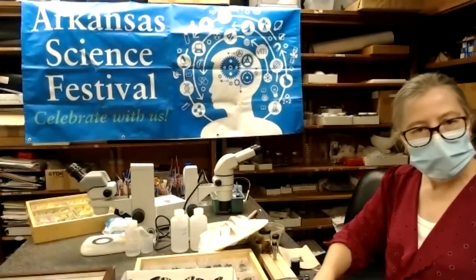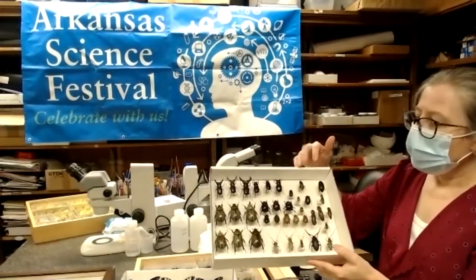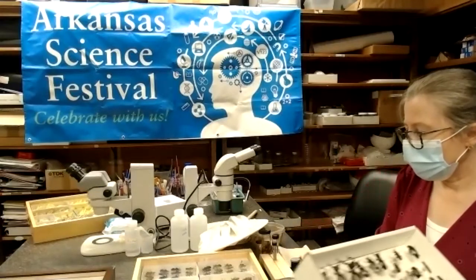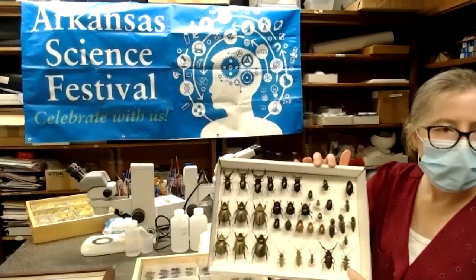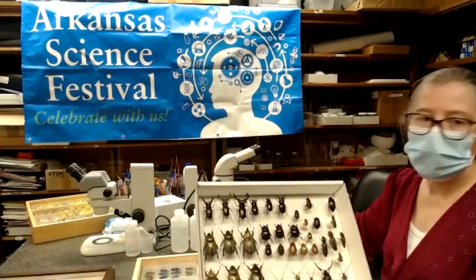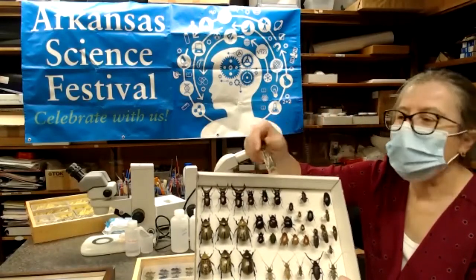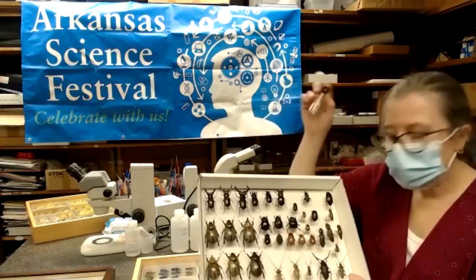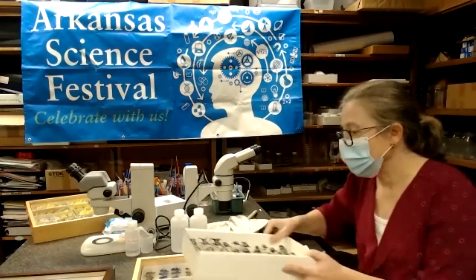And these insects, if you preserve them correctly, pin them well, and put them in a beautiful Cornell drawer, which I'll show you here in a minute, these drawers prevent other insects from coming in, and these insect pins will not rust. Do not use the ordinary sewing pins that you use for sewing and crafting. These can be used in entomological projects, such as spreading butterflies.